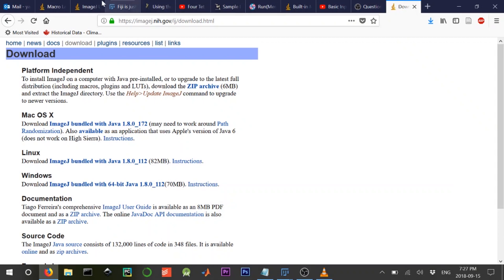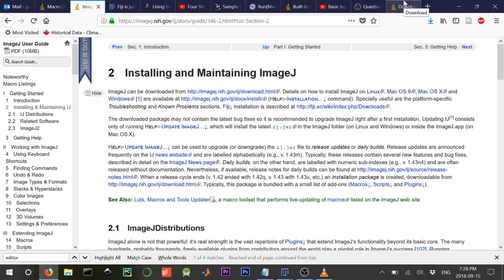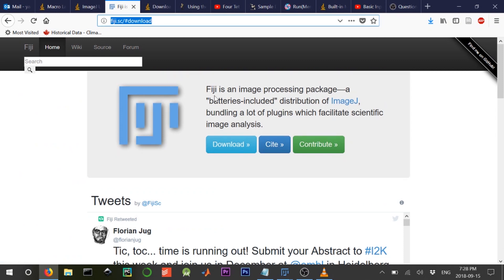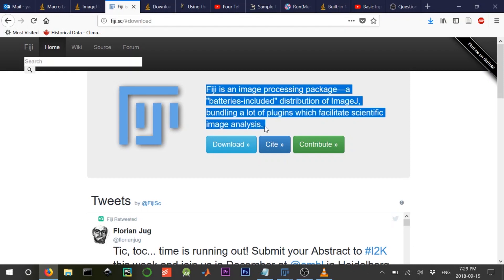Today we're going to solve a problem on ImageJ. ImageJ is image analysis software used by people who do microscopy. You can download it for free at imagej.nih.gov, but I advise you to download Fiji instead, which is ImageJ with scripting power. That's what we're going to use today.